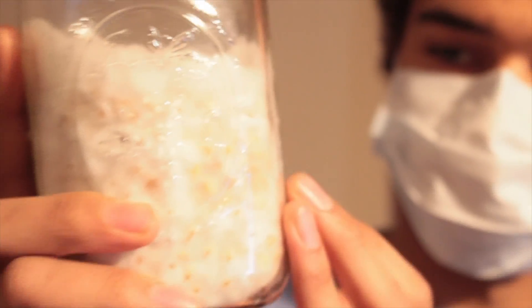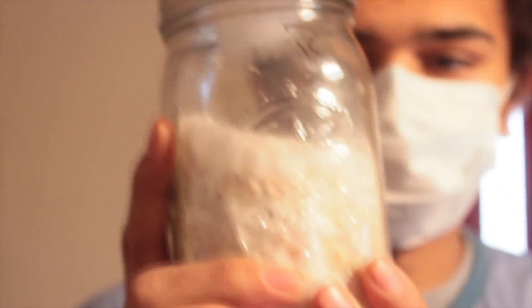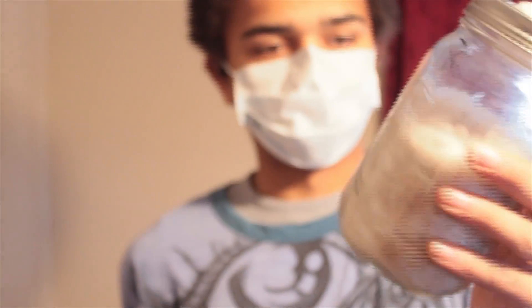Alright everybody, it's Will. Doing one of our MycoSynBiote videos. We have some reishi mushroom here that is fully colonized on some corn. What we're going to do is break this up and introduce it into our bag of coco coir. This is going to be an experiment to see how reishi fruits off of coco coir and coco chips.